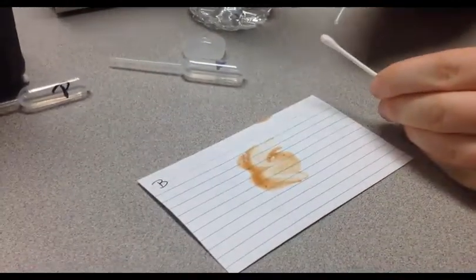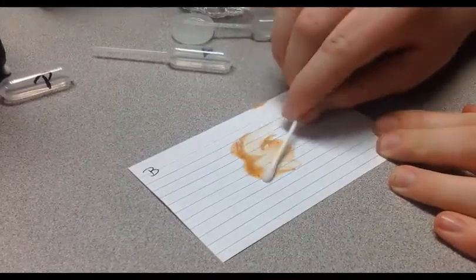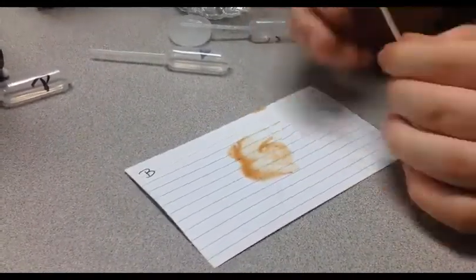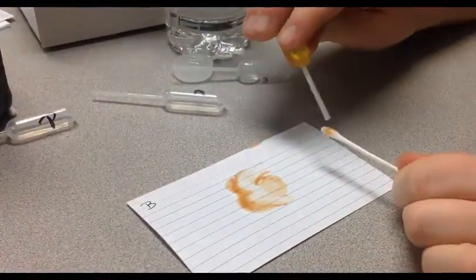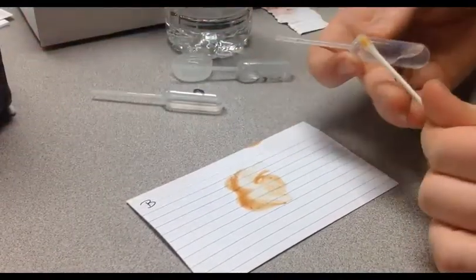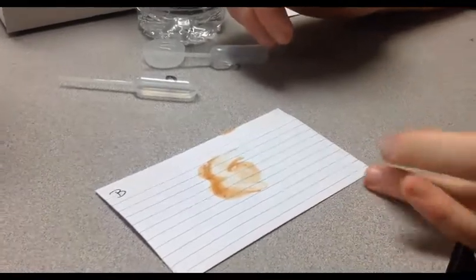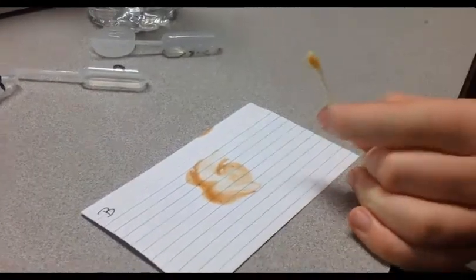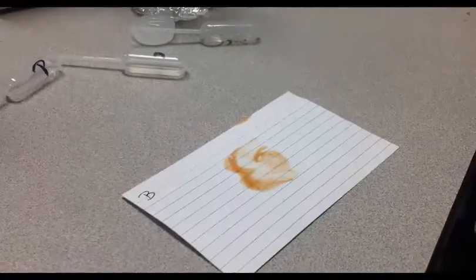Now B. Again, add some water. Swipe it across the stain. Gather some on the Q-tip. Add the alcohol. Then the phenolphthalein. And finally, the hydrogen peroxide. Again, no color change. So it is negative for blood. It is not blood, so we move to the next one.